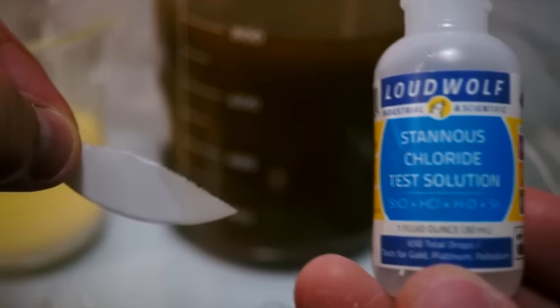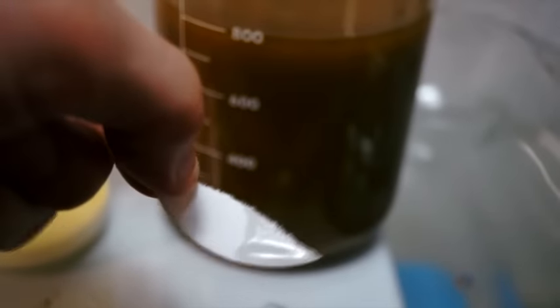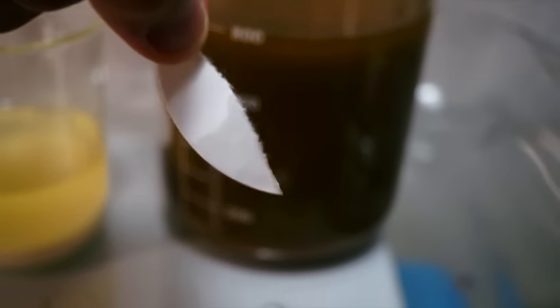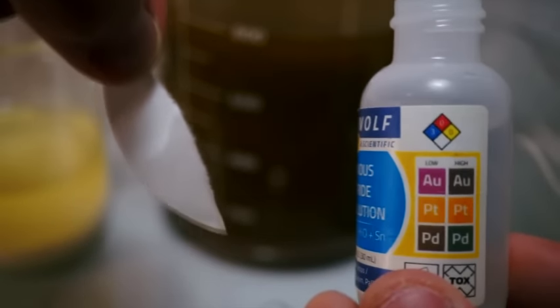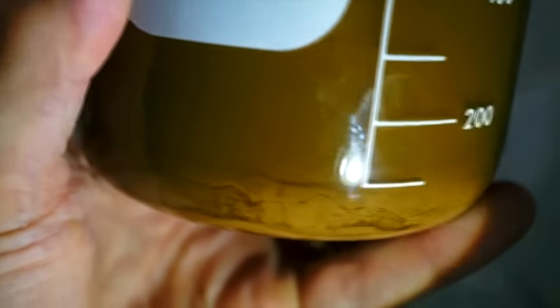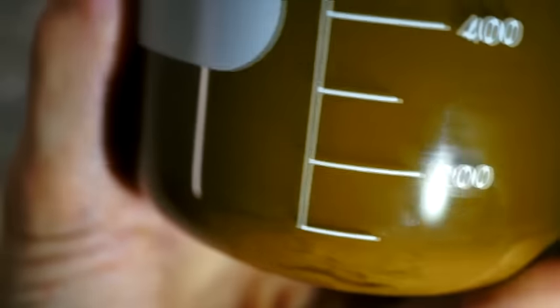We will now perform a stannous chloride test to be sure that all the dissolved gold has dropped out of solution. Everything looks clear. Allow the heavy metallic gold particles to settle out at the bottom of the container.